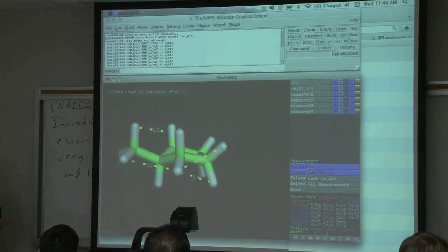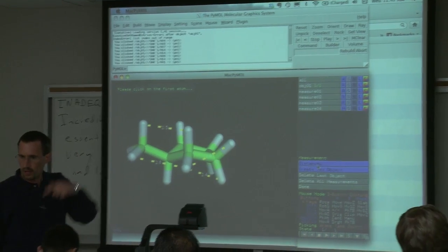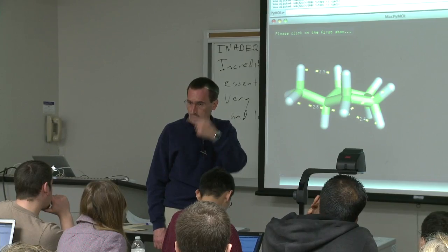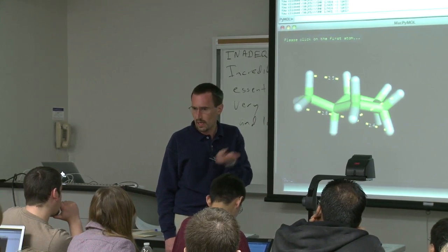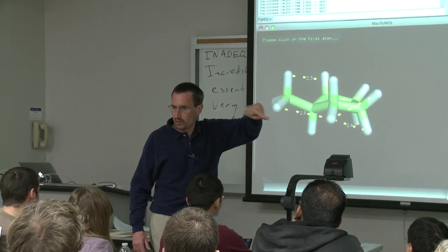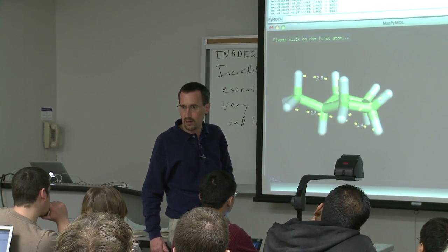So remember that coupling constant calculator, and we did it two ways. One was by taking it onto the modeling facility computers and using Macromodel, where it had a Karplus calculator built in, and the other way was a website that linked to the Tetrahedron paper on typical J values with different substituents. If you just wanted to use the website, you could just get your dihedrals. You pull dihedrals there, you click on the 4 atoms, hydrogen, carbon, carbon, hydrogen, you get your dihedral, and you put in your substituents on the pull-down menu on that Tetrahedron calculator.